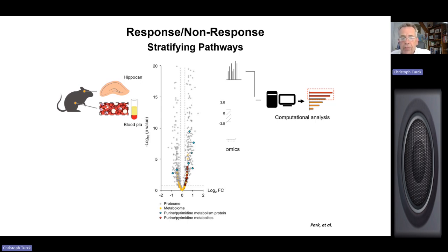So anyway, in this case, we took the hippocampi of these mice. Hippocampus is involved in depression. That's been known in patients and also in mice. Then my student at the time, Dong-Ek Park, did extensive proteomics and metabolomics. To make a long story short, he found again a lot of up or down regulated protein expression. Whatever you see highlighted here with colors, these are results from proteomics and metabolomics.